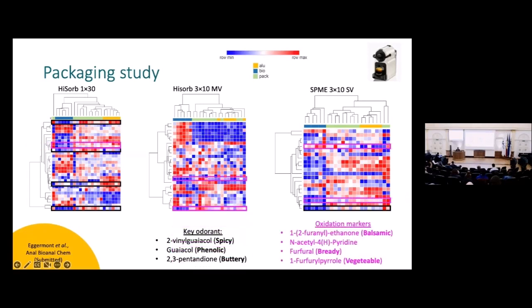But if we are talking about oxidation markers, we already found some oxidation markers within. Most of them are present in less amount, sorry, in a biodegradable one, except the furfural, which is known to be a degradation of the furfuryl alcohol.